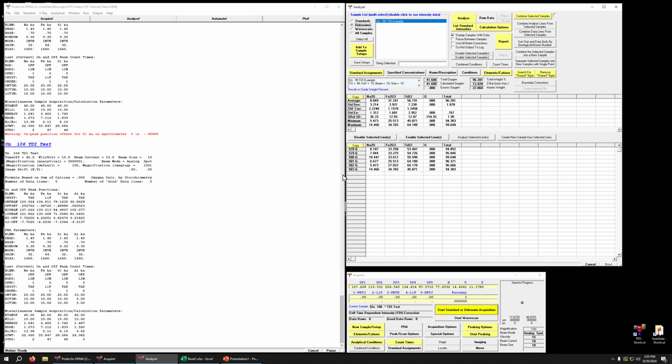This can obviously result in some pretty spurious analyses, as the average intensity acquired over the course of analysis will not reflect the initial state of the sample, which is what we want.